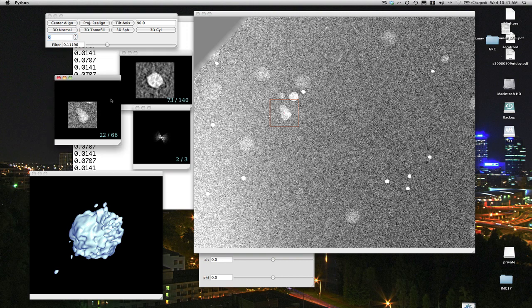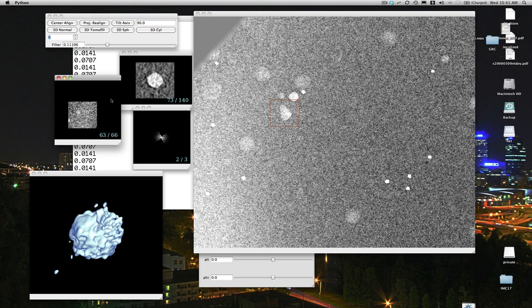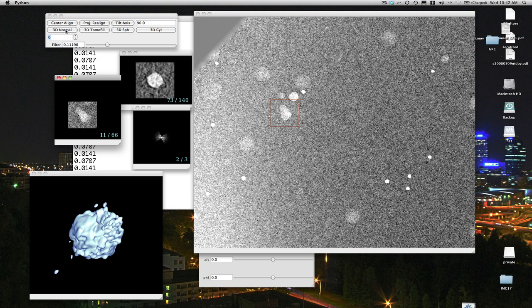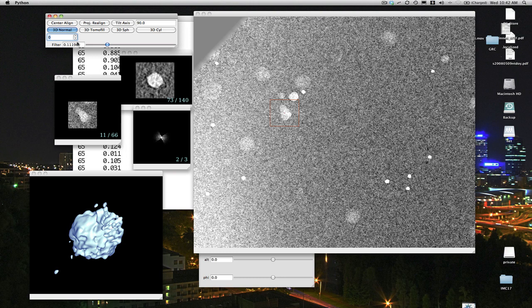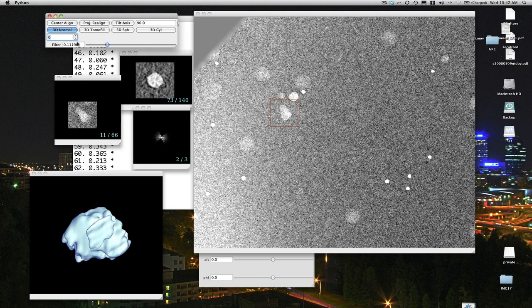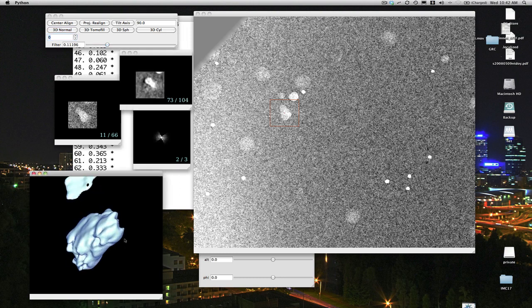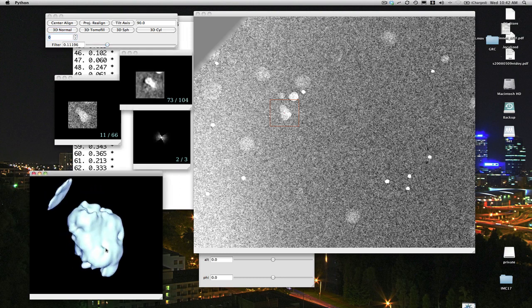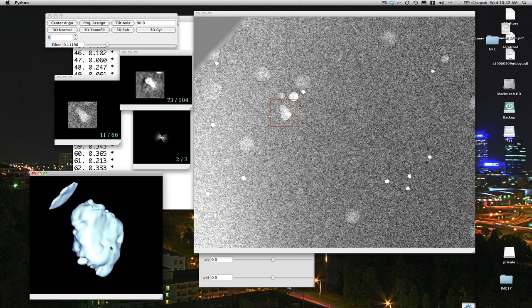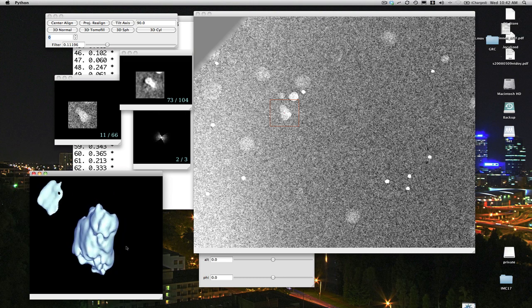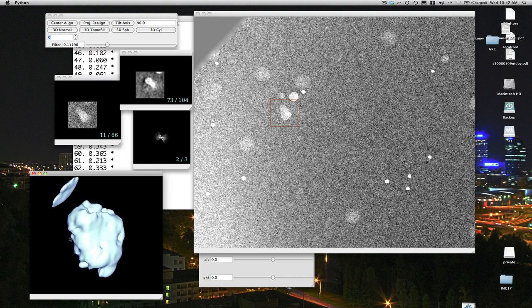So you can see there's still a little bit of work to be done to really make this a perfect tool. Again, you can see it's losing the last few images in the tilt series. I suspect this tilt series that I'm playing with here just isn't perfect. Let's do a reconstruction of that, and then we'll see it will replace the existing reconstructions that we have, and we can see the shape of this, the three-dimensional shape of this blob that we've reconstructed. We can go through the reconstruction and see what it looks like.